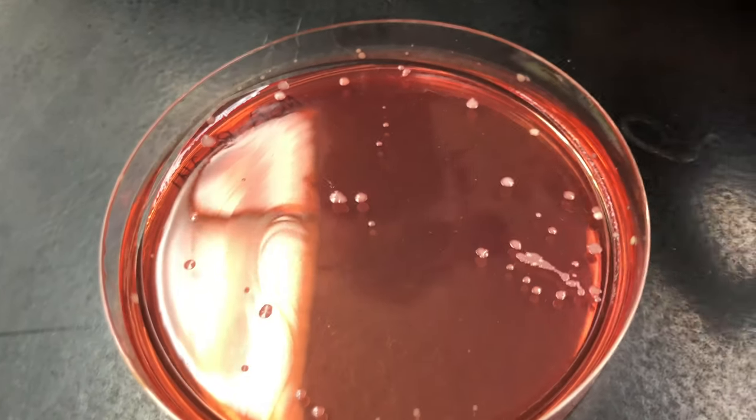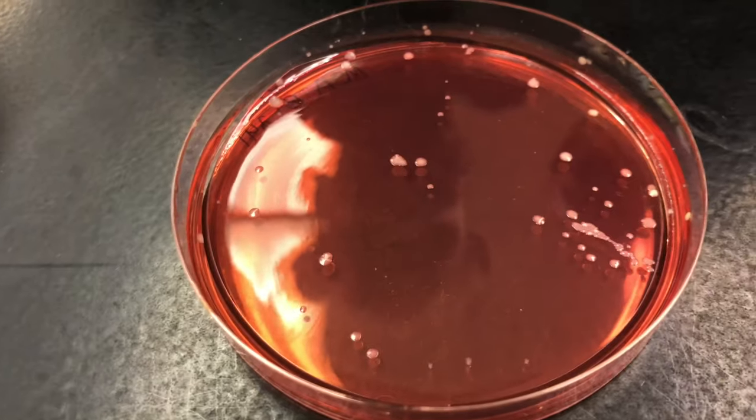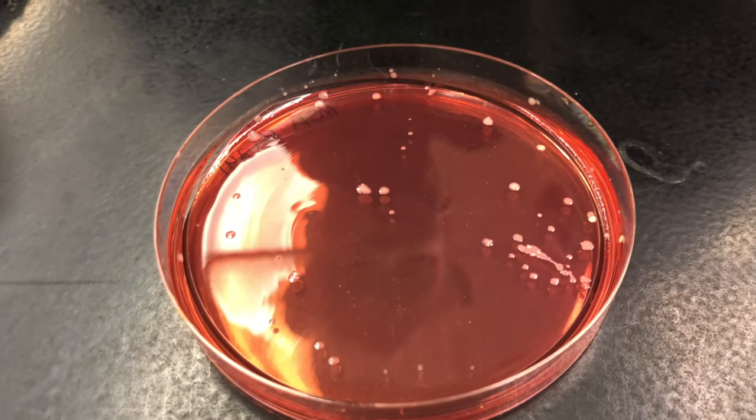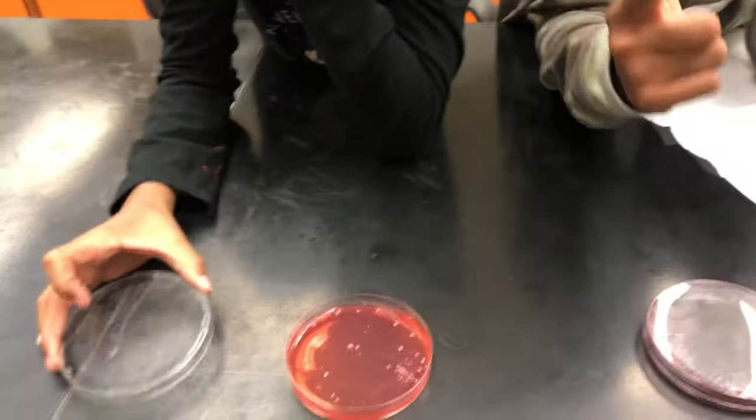Wow, flip it over — that's only a little bit. It grows halophiles like staph, and it looks like there's more than one type of organism on this plate. I think we should stain it and see what it looks like. Do you want us to close it back? Yes. Do you want to stain it, girls? Yes, okay — let's go to the lab.